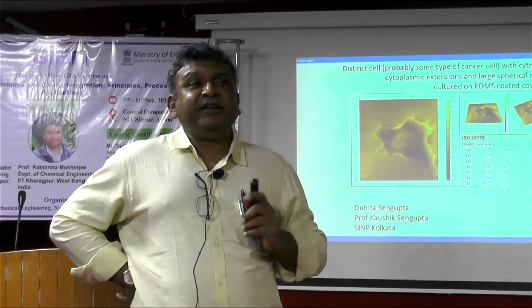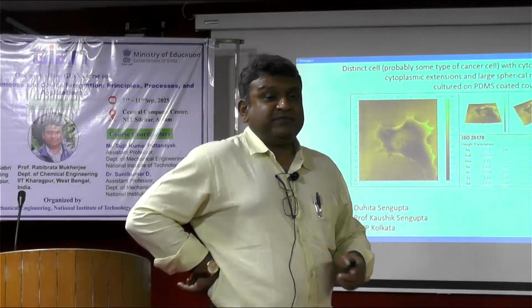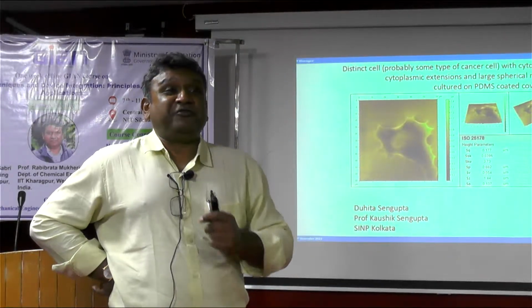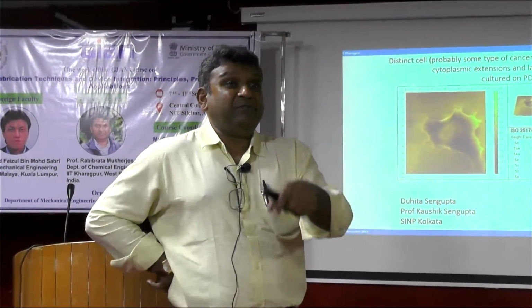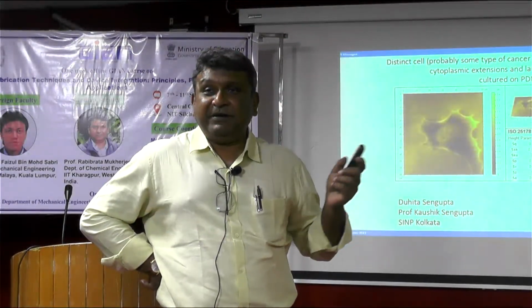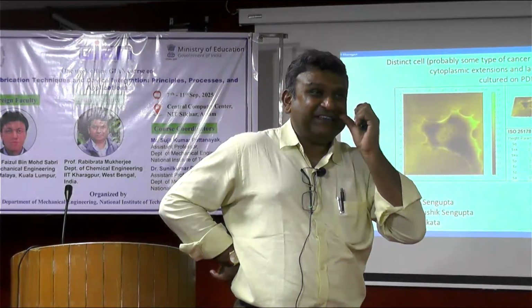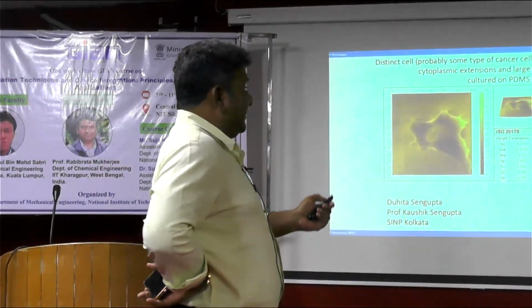In fact, we did some very interesting project for 3M or some company. I should not take names. So you know about the sellotape, right? They wanted to see the morphology. Normally, when you take the tip, AFM morphology, because it's an adhesive tape, the tip was getting attached. So we could cleverly use the tapping mode so that it went, picked up the morphology, but did not attach. I have trained somebody, not my student.